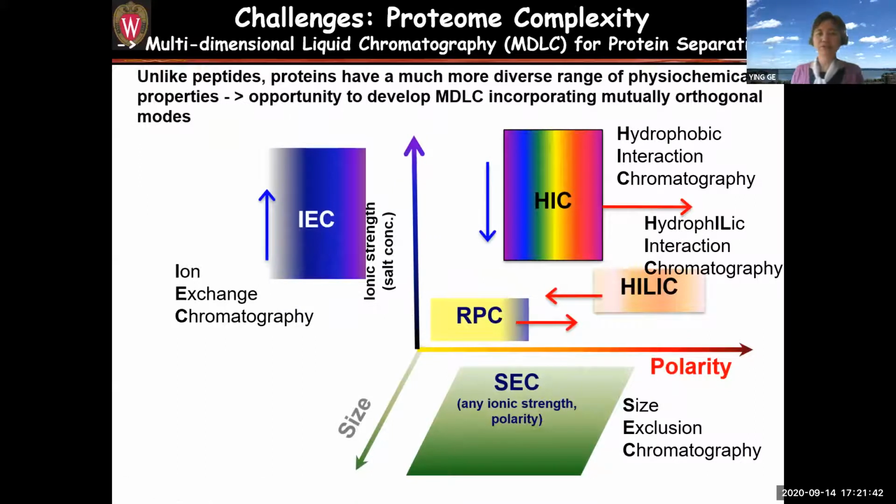Okay, now I'm going to switch gear to talk a little bit about the chromatography strategy that we have been developing in the lab. So unlike peptides, proteins have a much more diverse range of physical chemical properties. So this gives us the opportunity to develop multidimensional chromatography incorporating mutually orthogonal modes.